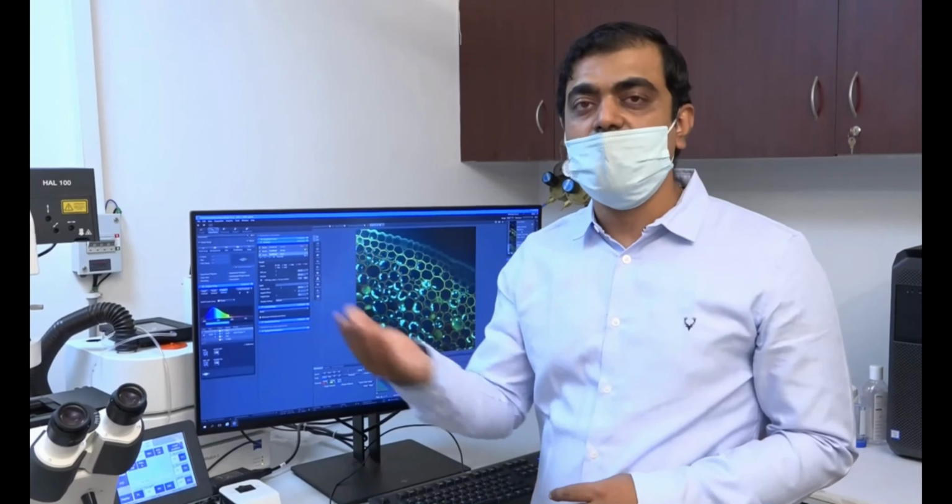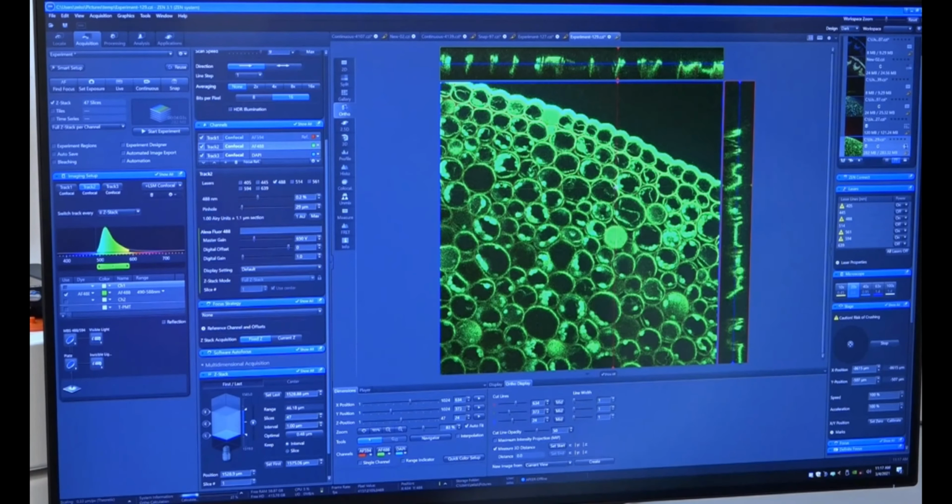So in YZ plane, if you want to measure the thickness, you can simply measure it using a 3D. You can say I want to measure the distance between 2 cell outlines. So there are 2 cells which are lying close to it. You want to see if there is a gap or not. If you want to measure that distance, you have to simply click start.